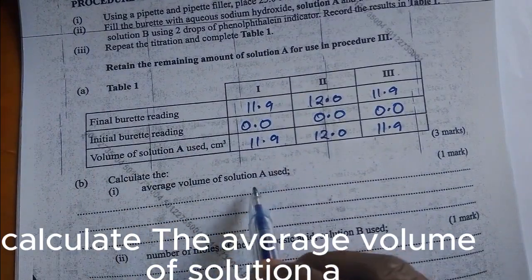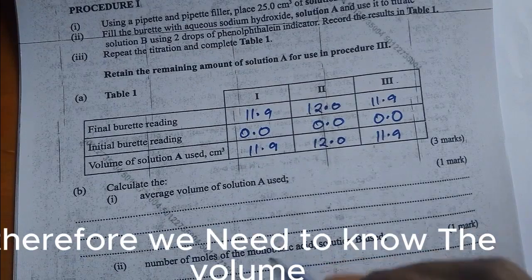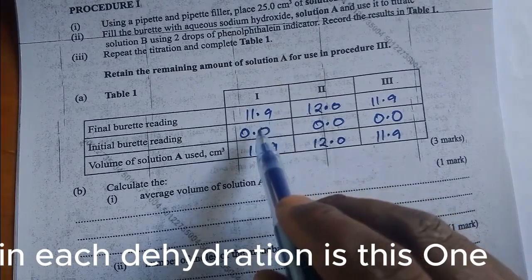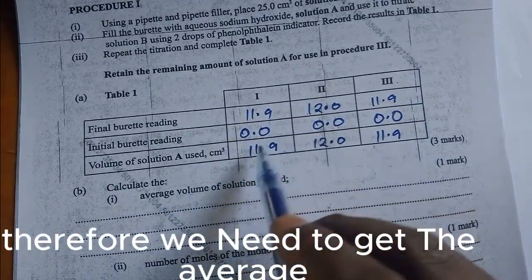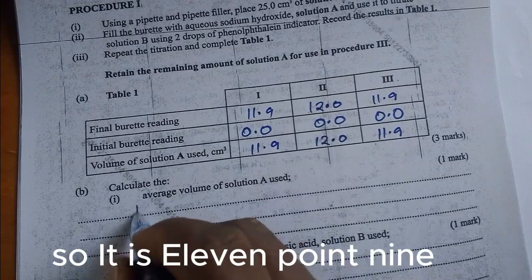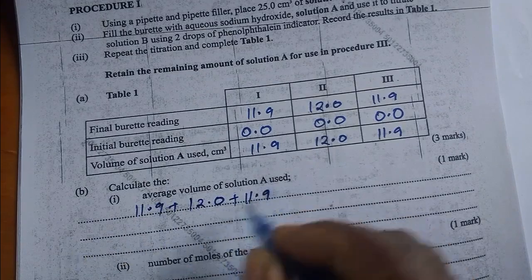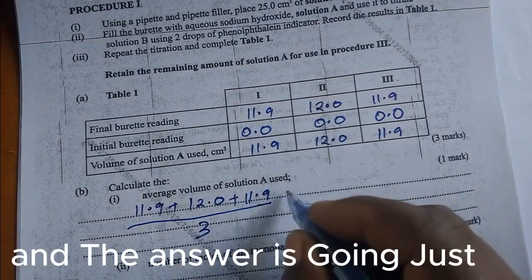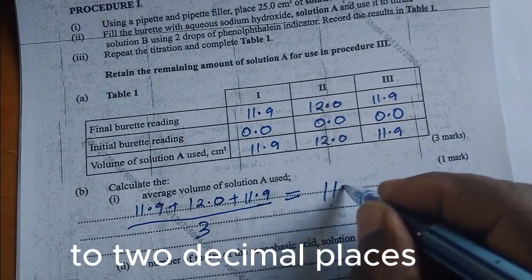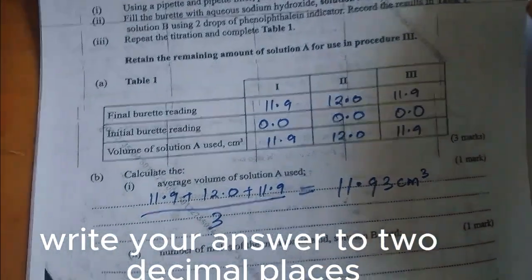Calculate the average volume of solution A. You should remember solution A is the one that is in the burette. Therefore, we need to know the volume in each titration, and then we need to get the average. Since my volumes are very close, I will do the average of the three. So it is 11.9 plus 12.0 plus 11.9 divided by 3. Just press your calculator and write the answer directly to 2 decimal places.